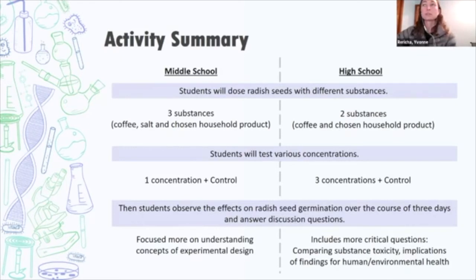So in terms of the amount of time it takes, the initial setup is pretty simple. I think it might have taken me an hour because I was multitasking. Emily, you can jump in if you remember this more clearly than me. And then the actual collection of the data each day takes maybe 5 to 10 minutes.